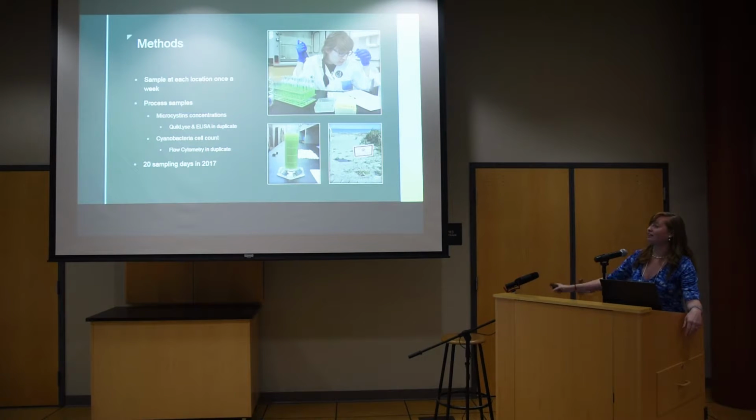So this was taken this summer. You can see it's very, very green. And I actually took this sample from the beach, believe it or not. Beach 6, we had a really, really bad bloom this year. And unfortunately, I don't have the data yet to compare. I have all the data, but I haven't sat down and compared the two from 2016 to 2017.